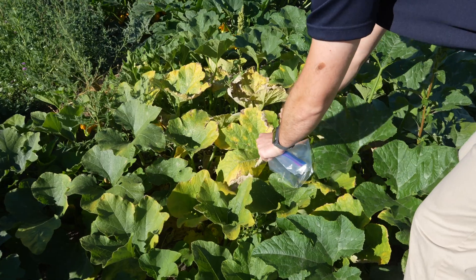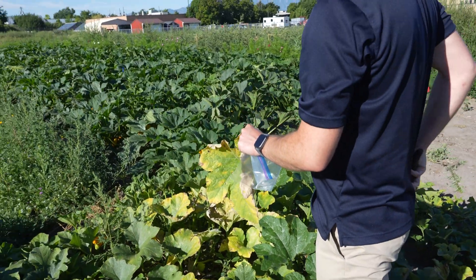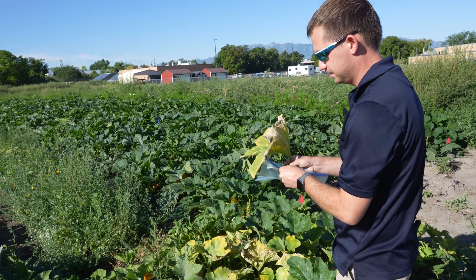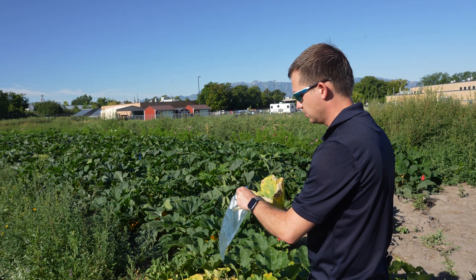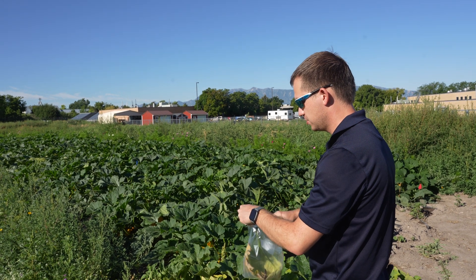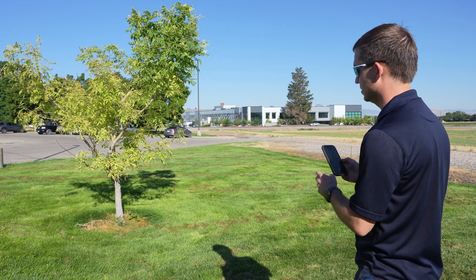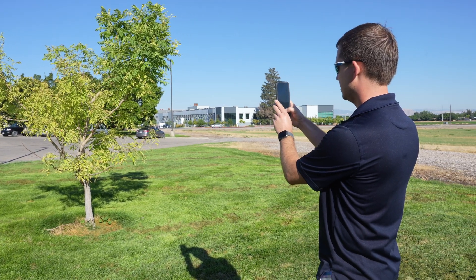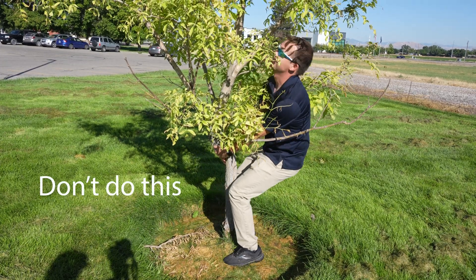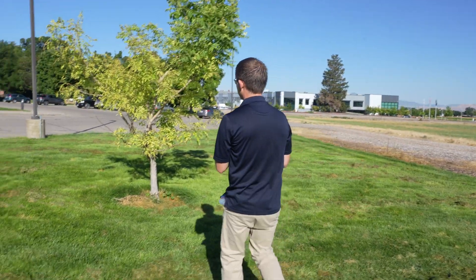Then you must collect the sample to be sent. If possible, collect the whole plant or small areas of all parts of the plant, such as roots, leaves, and fruits. If the plant is too large, we usually need to see tissue that is symptomatic but still living. We can't do much with dead or dried up tissues. If the plant is too large to submit in entirety and you are unsure of what tissues are needed for diagnostic testing, contact the diagnostic lab prior to sample submission.